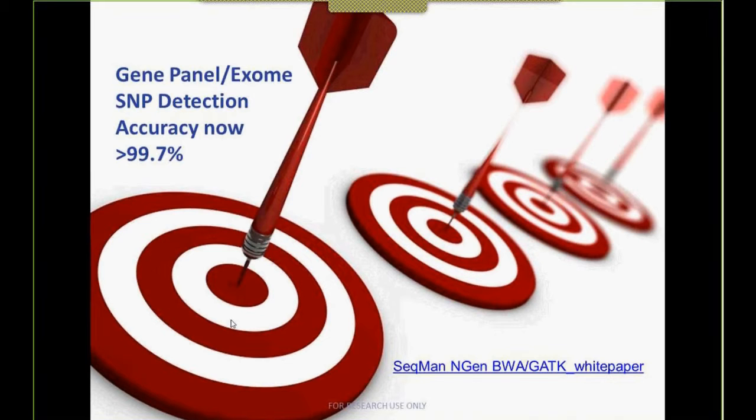A very large answer that has, in an exome's case, 15,000 data points in it. Those are the kind of data sets we needed to improve the software and make it as accurate as it is now. Right now our accuracy with Illumina data on these exomes is about 99.7. The Genome in a Bottle answer isn't 100% accurate. It's close. It's probably 99.9 or 99.95, somewhere in that range.